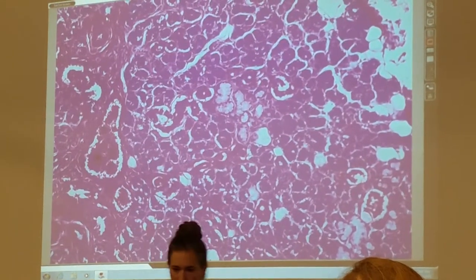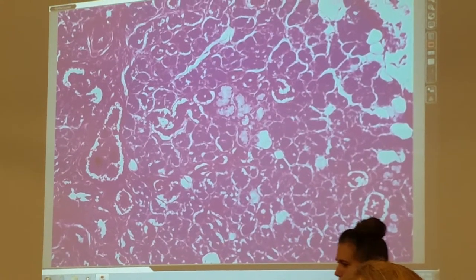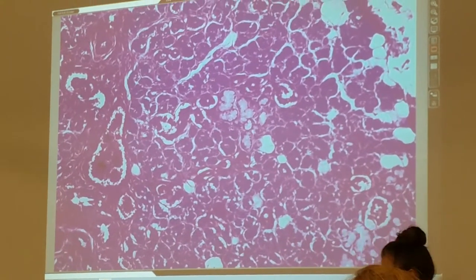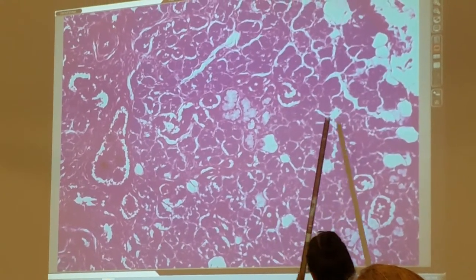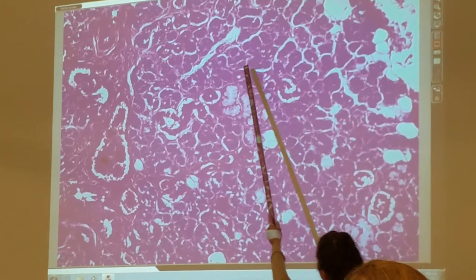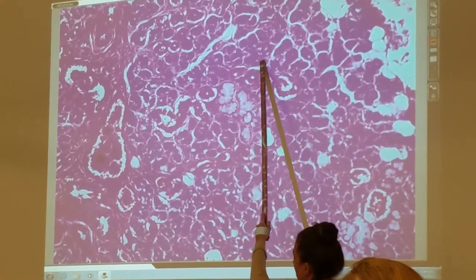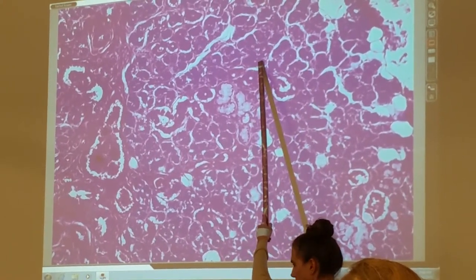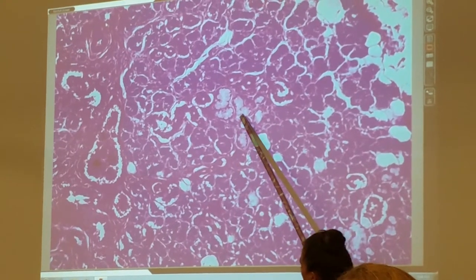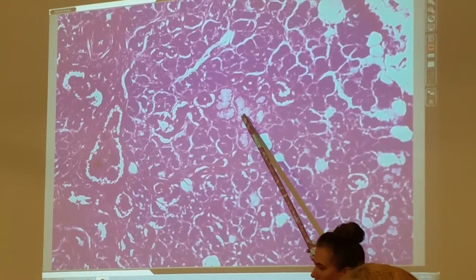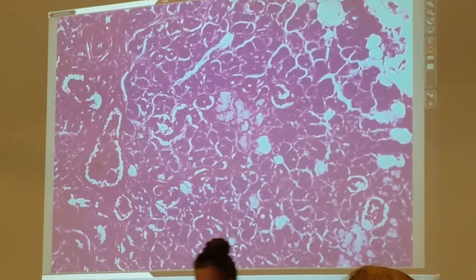What's the name of this gland? Submandibular. Submandibular gland — remember, there's going to be a lot of this material. What would we call this material? Serous acini, with small clusters of mucous acini.